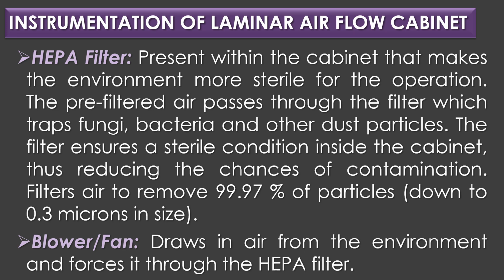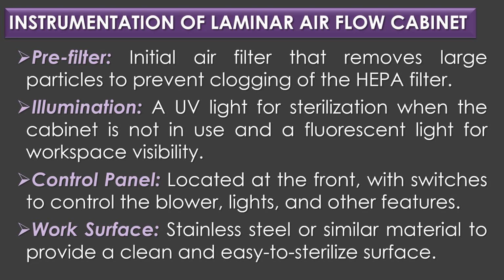Blower or fan. The blower or fan draws in air from the environment and forces it through the HEPA filters. Pre-filter. The pre-filter is an initial air filter that removes large particles to prevent clogging of the HEPA filter. Illumination.